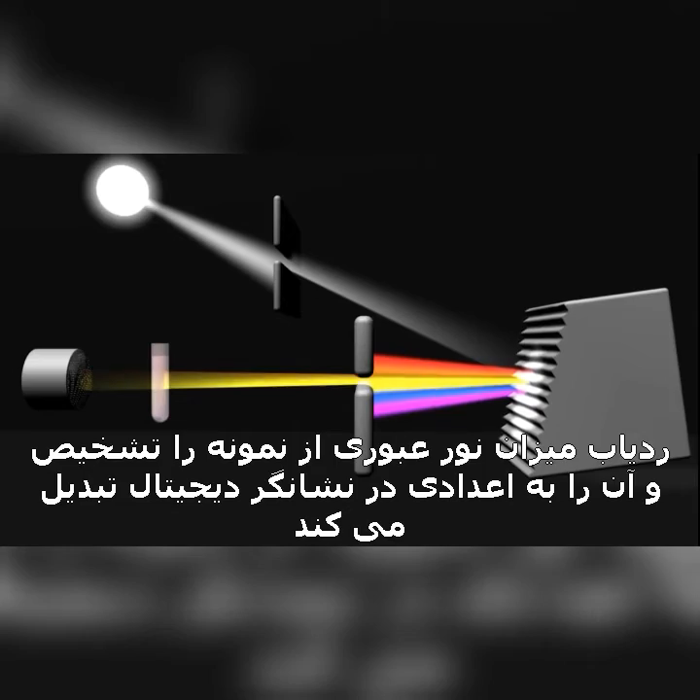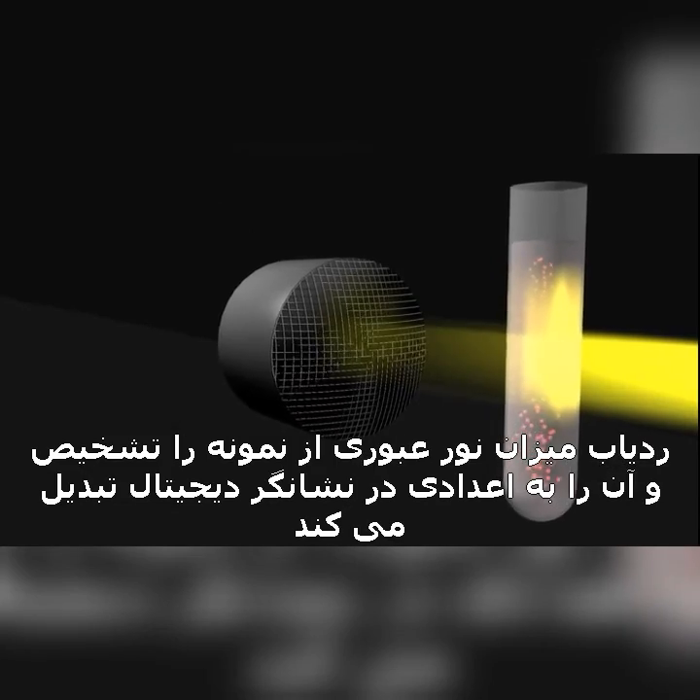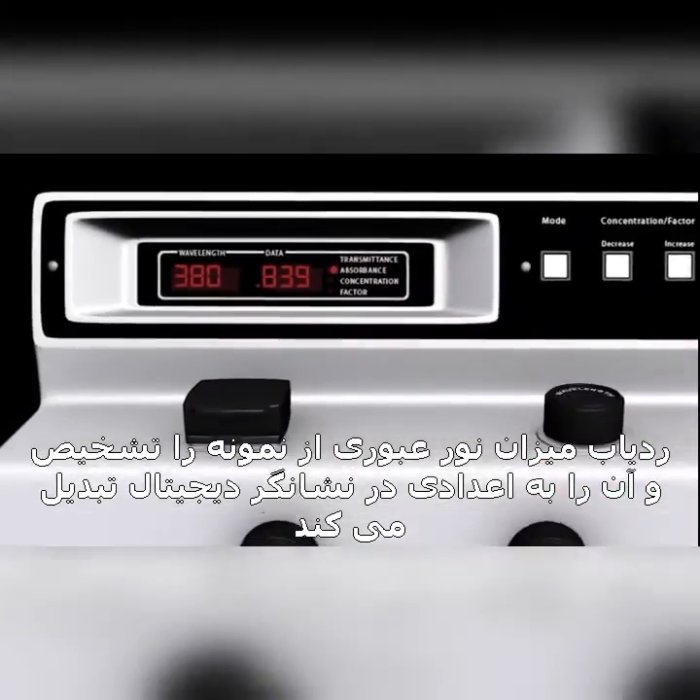The detector senses the light being transmitted through the sample and converts this information into a digital display.